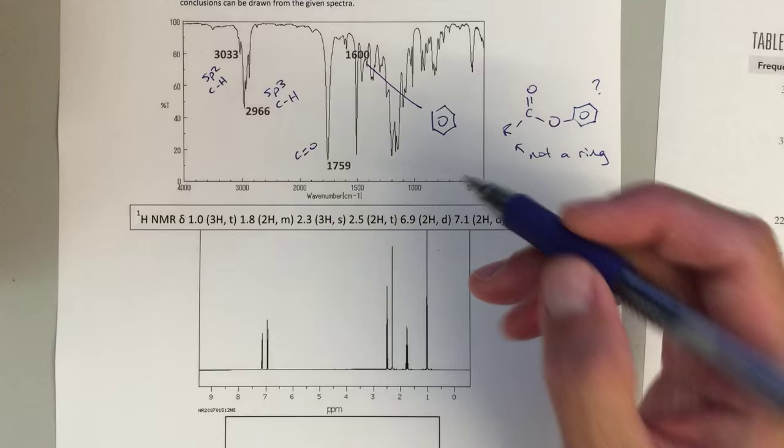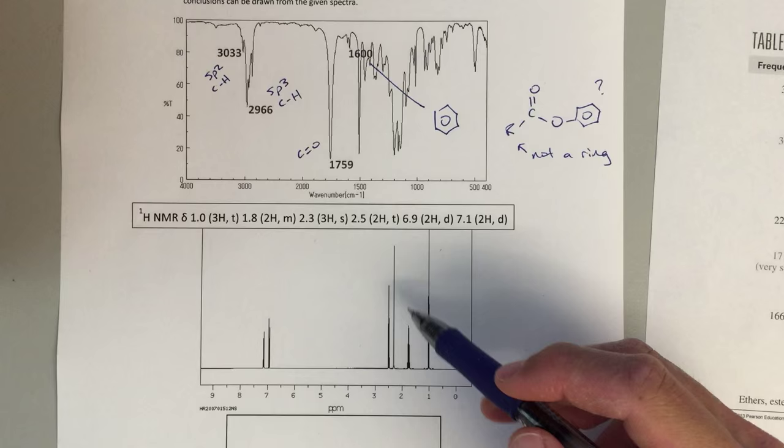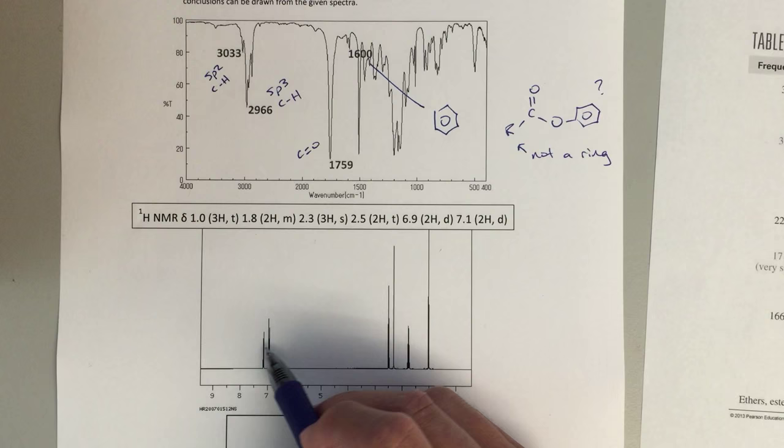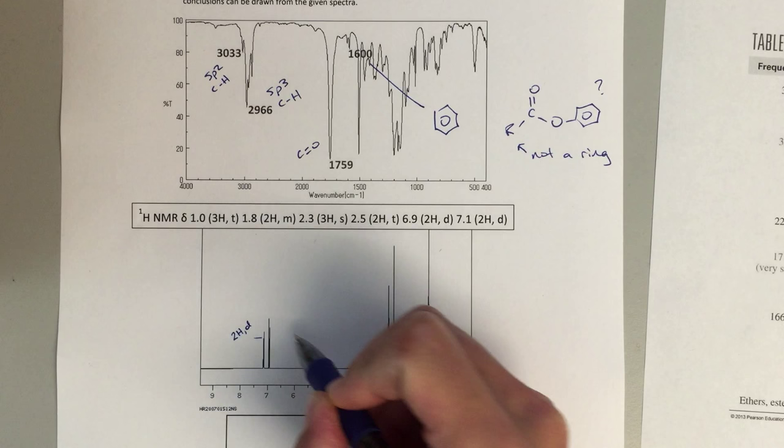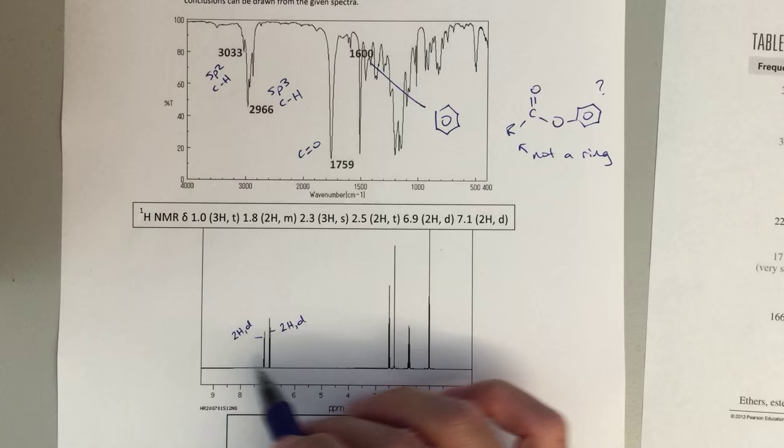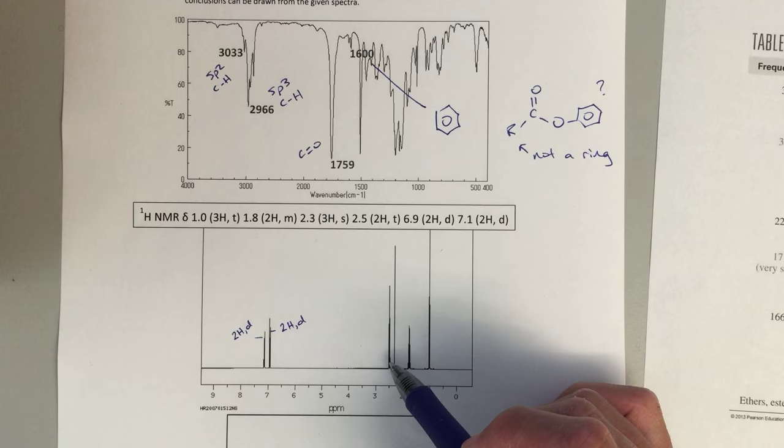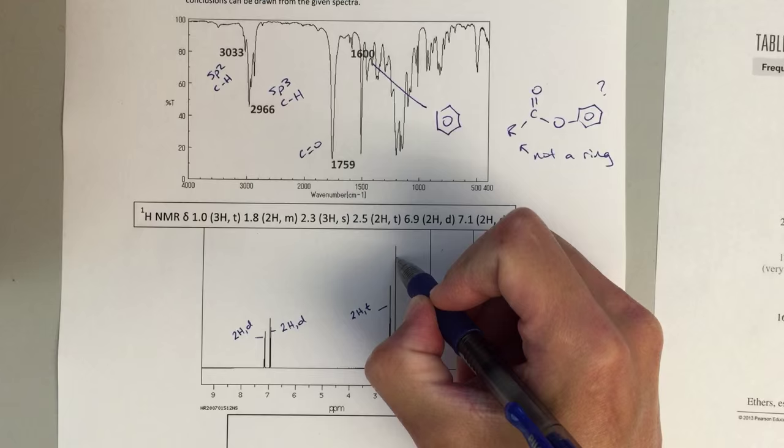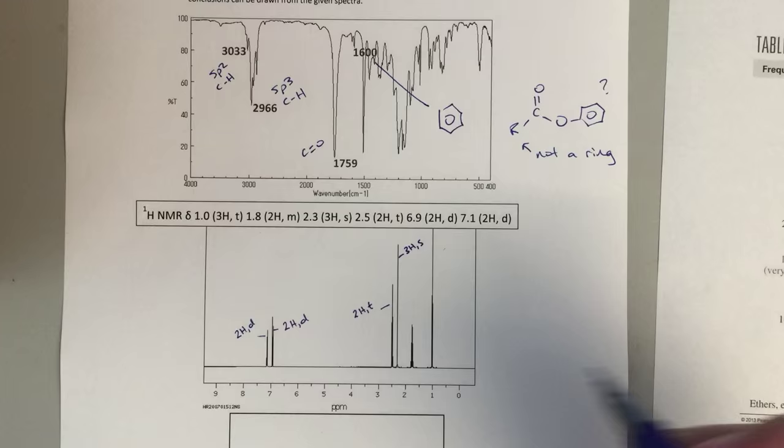So let's go to the NMR and see what we can find. This is how I'm going to present the NMR to you, and it's hard to interpret this. So what I would really recommend is labeling all these peaks. Out here I've got a 2 high doublet. This one is again a 2 high doublet. So writing the information on the actual NMR spectrum makes it easier to interpret. Here at 2.5 this is a 2 high triplet.